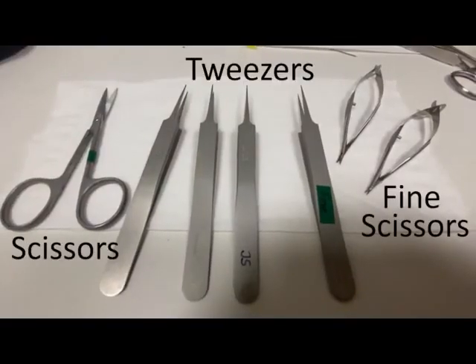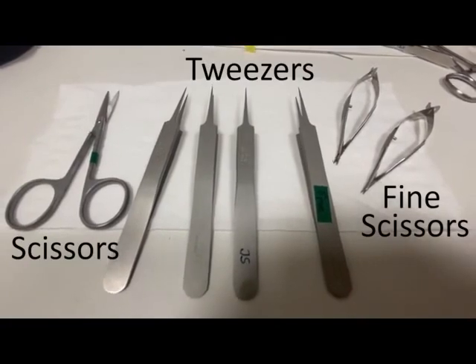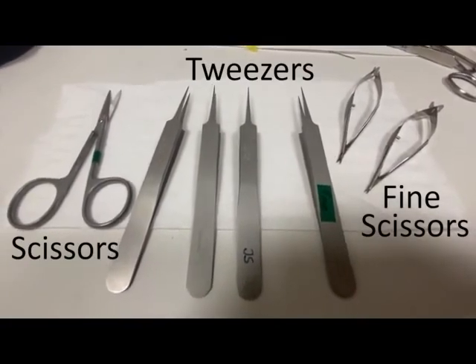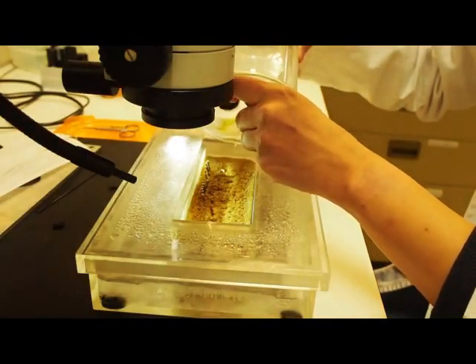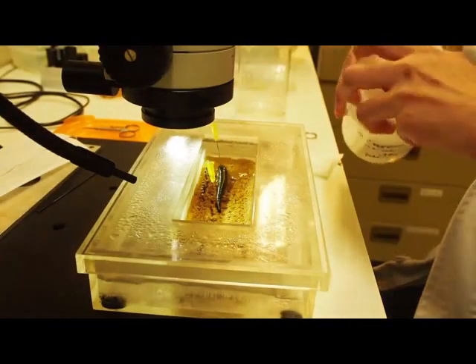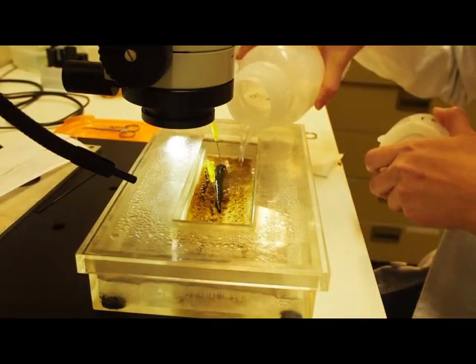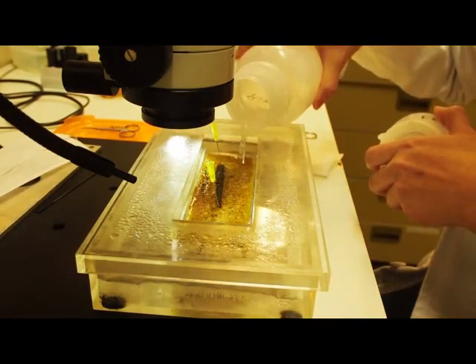Here you can see our dissecting instruments: different scissors to open the leech and different kinds of tweezers to pin and dissect the ganglia. Now we need to transfer the leech from the beaker to a wax bed and cover it with cold saline to maintain the normal cell function of the leech's nervous system. And now we can start dissecting the leech.